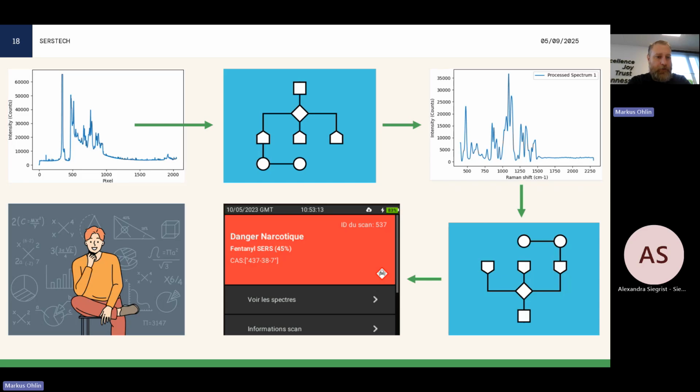So in here you have the reflected laser light, the Rayleigh scattering that we filter away. And then you have the sloping Raman spectra here with the fluorescence signal on top. So what we do with that signal, it undergoes a very clever mathematical operation in the first algorithmic step, which can find what is Raman signal and then remove everything else that is not of interest for this type of spectroscopy.